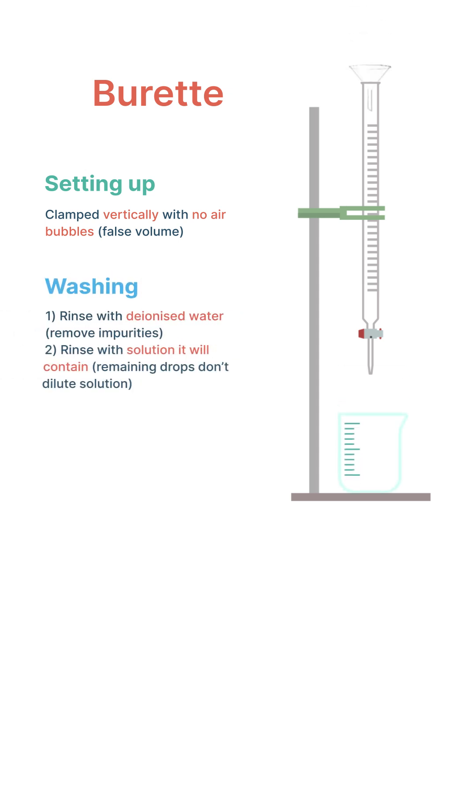We prepare the burette in the same way as we prepared the pipette. We first rinse it with deionized water to remove any impurities, and then we rinse it with the solution it's going to contain. This ensures that any drops remaining on the inside of the burette will be exactly the same as those it will eventually contain.